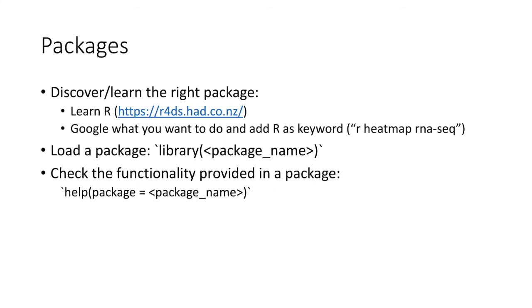So yes, you'd need to go onto the teaching cluster, load R, and then inside R, it will change the prompt and it will be another command line interpreter. It's another interpreted language. The prompt will change. And at that point, you would need to load the package. First, you need to install the package, then you need to load the package, okay?